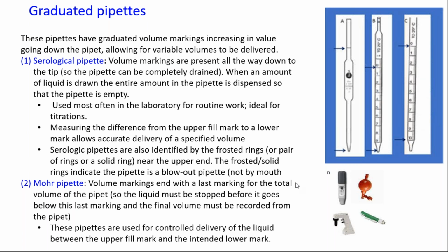But what is essential in the lab is that whether you use a volumetric pipette, a graduated blowout pipette, or a Mohr pipette, no pipetting by mouth. You have to use a pipetting aid such as a bulb or a pipetter.